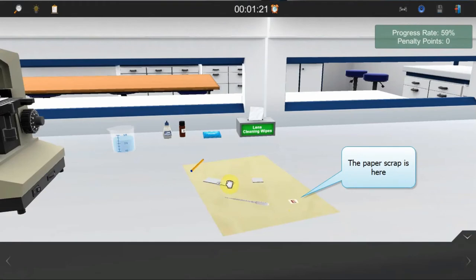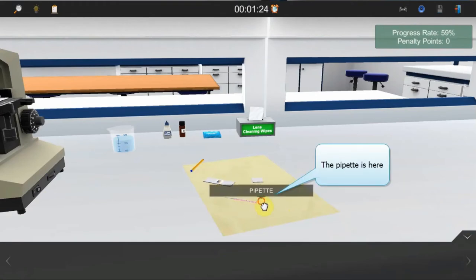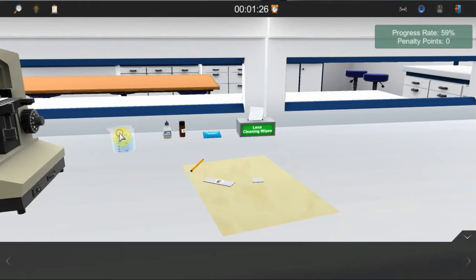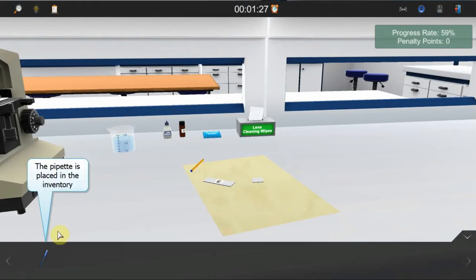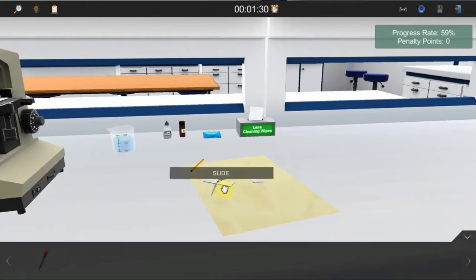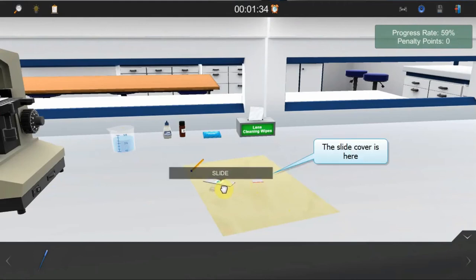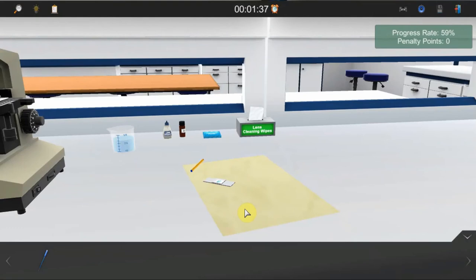Move the paper scrap onto the slide. Move the pipette onto the beaker to fill it with water. The pipette is now placed into the inventory. Move it over the slide cover and leave it to wet the paper scrap. Move the slide cover onto the slide. The test specimen is now ready.